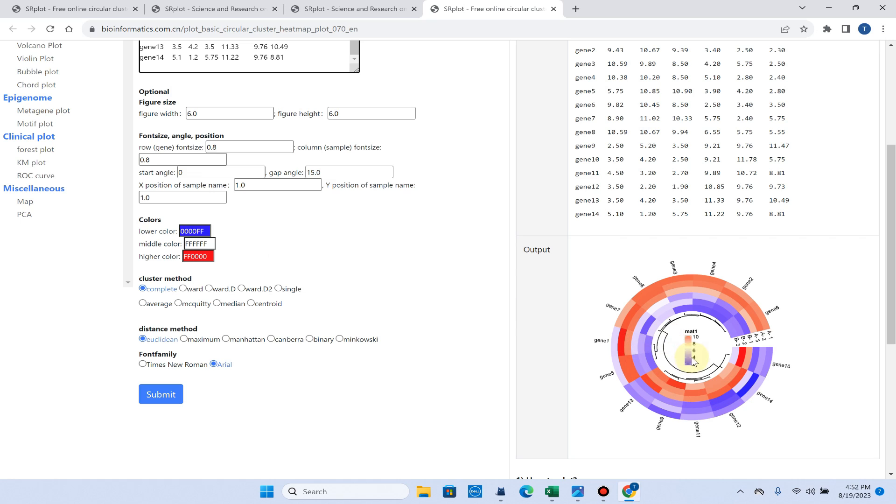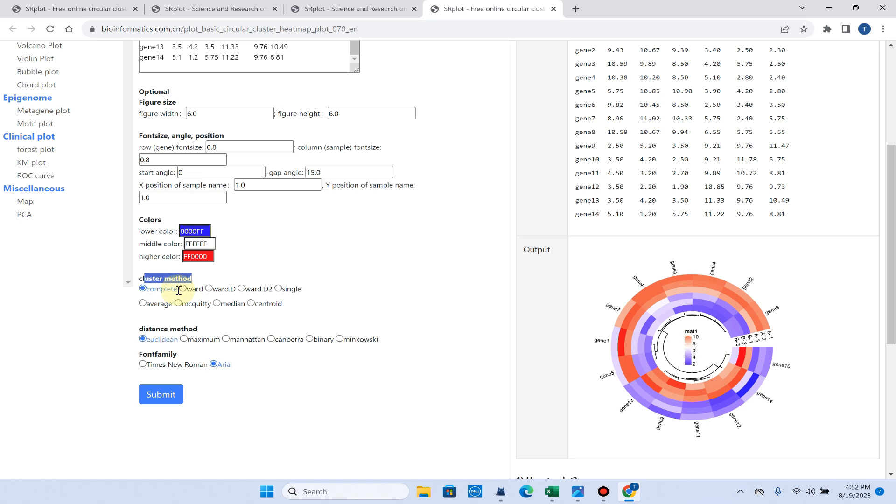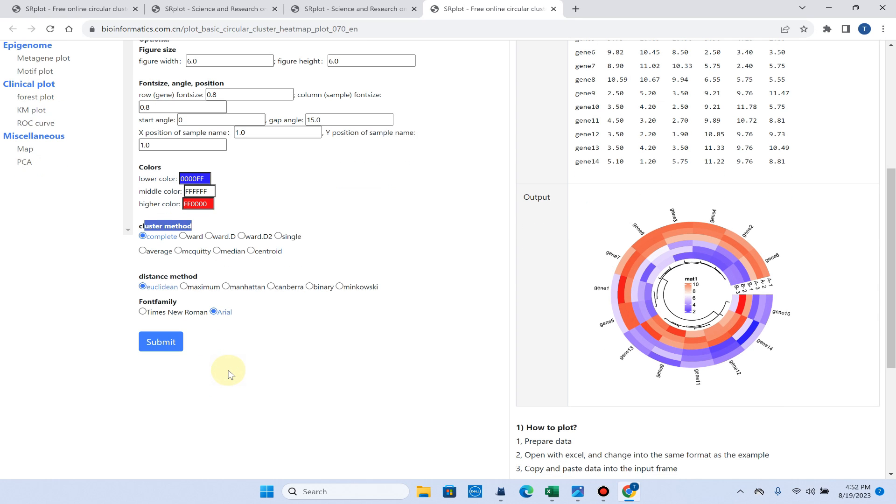If you want to change the lower color key, here you can see the lower color is set to blue. I will go with the default. The middle color is white and the higher color is red. For clustering method you can use complete and for distance method you can use Euclidean. For font family, I will select Arial.